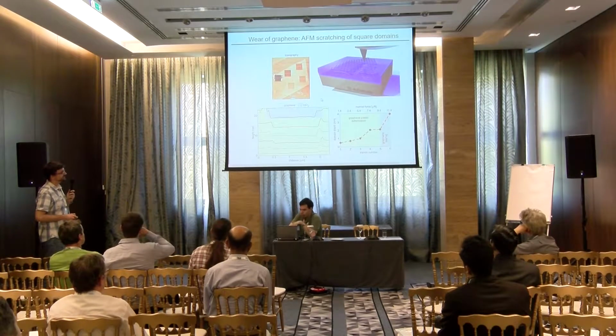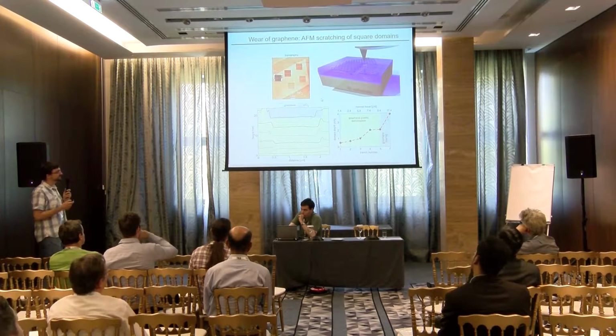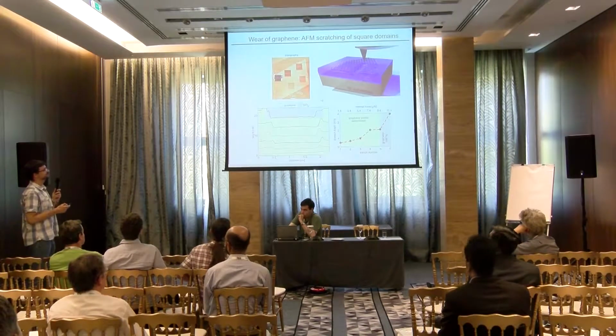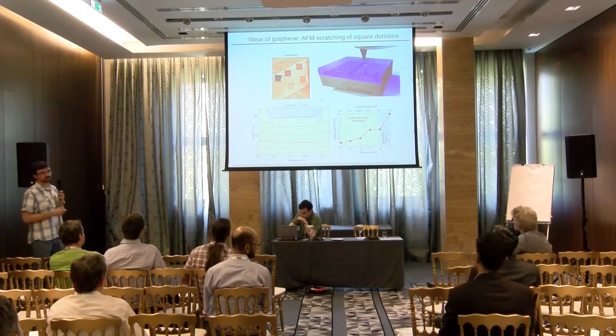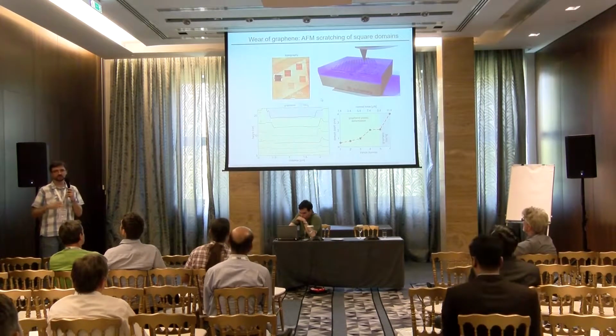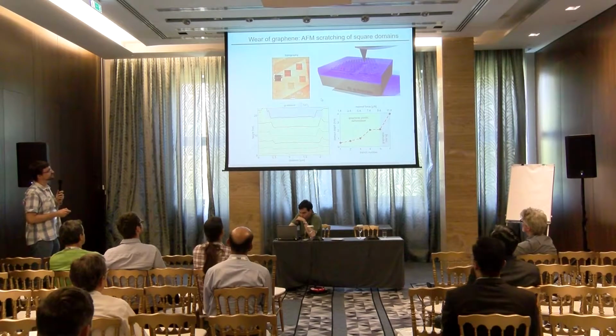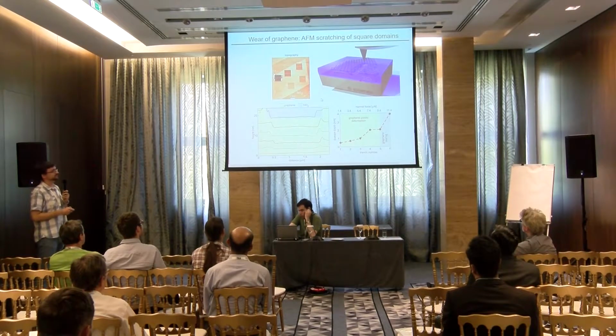and here you can see domain depth as a function of trench number and normal force during the scratching. And practically we see two possible scenarios. For domains 1, 2, 3, 4, and 5, you see that the topography is rather flat, smooth, without any bumps. So here, practically, as shown here, graphene is just plastically deformed, as well as the silicon dioxide substrate beneath the graphene.